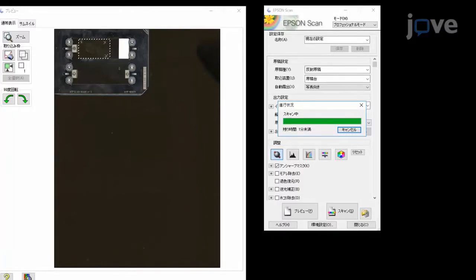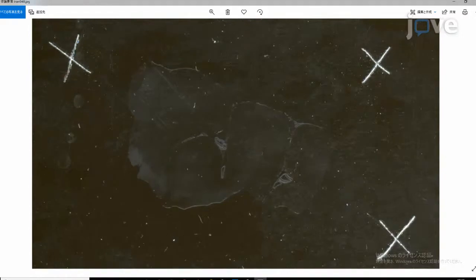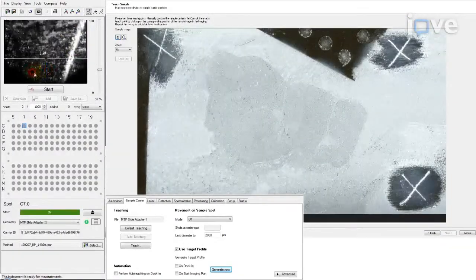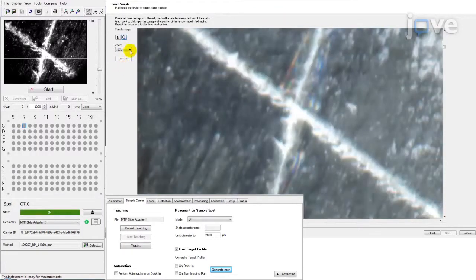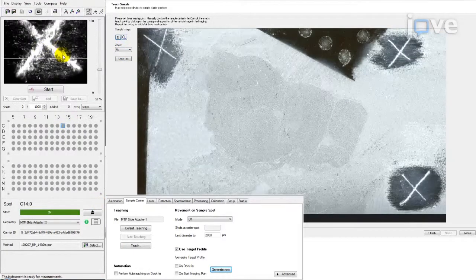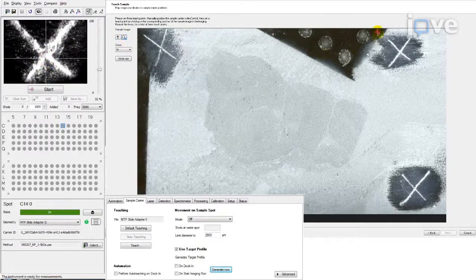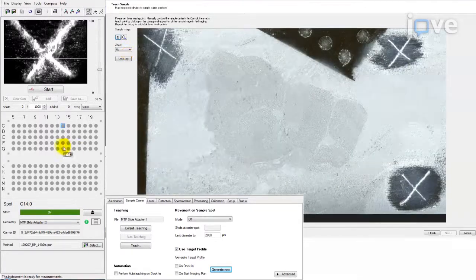Usually, it will not be possible to recognize the tissue section underneath the matrix layer. To correlate the optical images with the samples, make guide marks that are visible both in the optical image and underneath the matrix layer in the camera optic. The easiest way is to spot at least three correction fluid marks around the sample before taking the optical image.